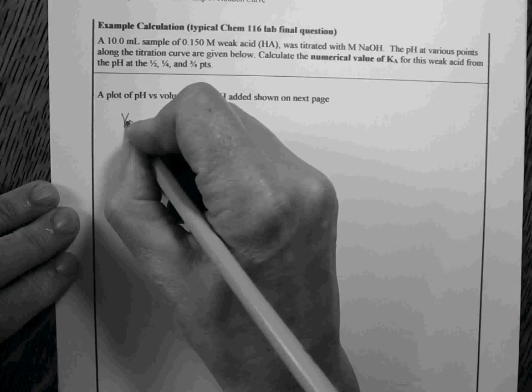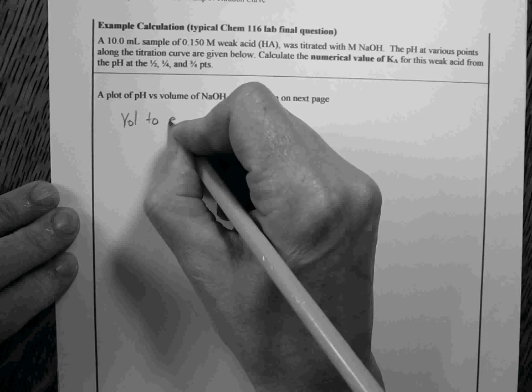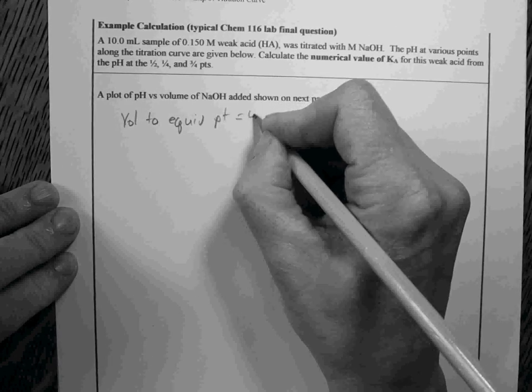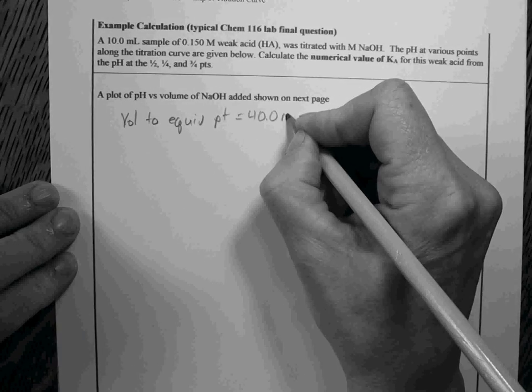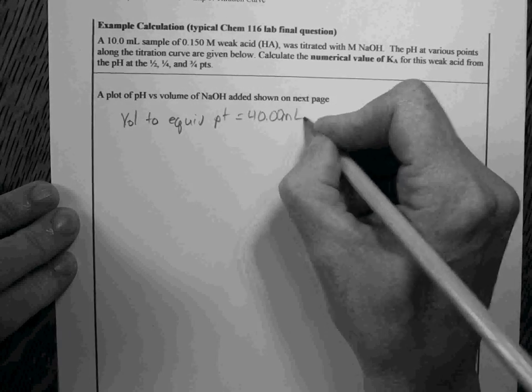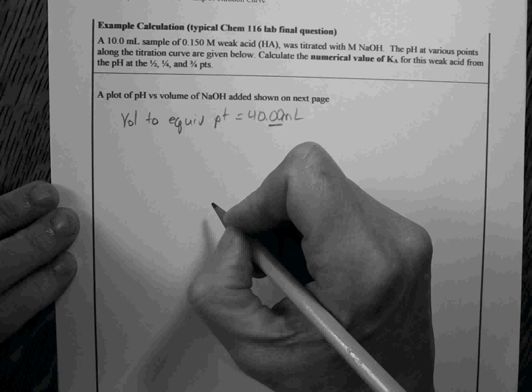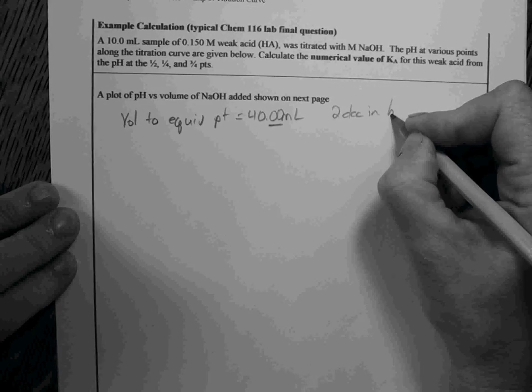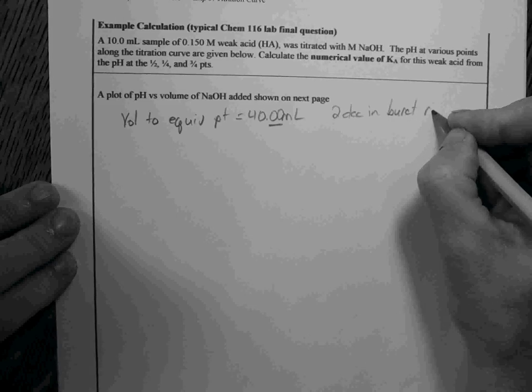The volume to equivalence point we determined was 40.00 milliliters. Remember, we always have 2 decimal places in every burette reading.